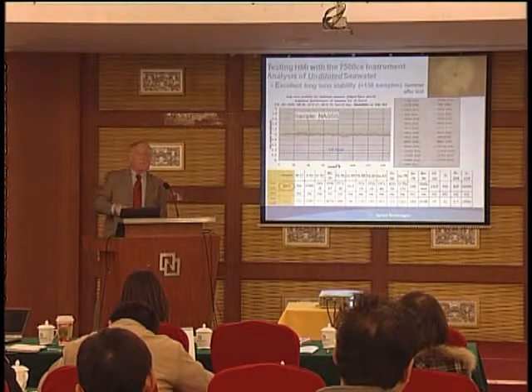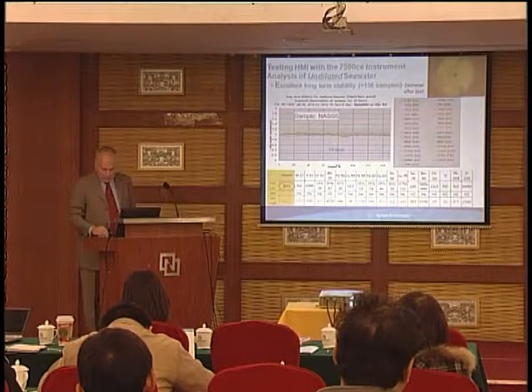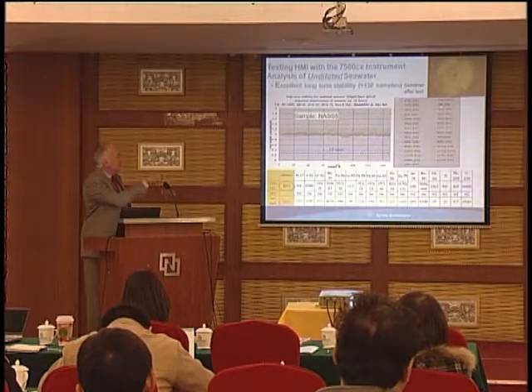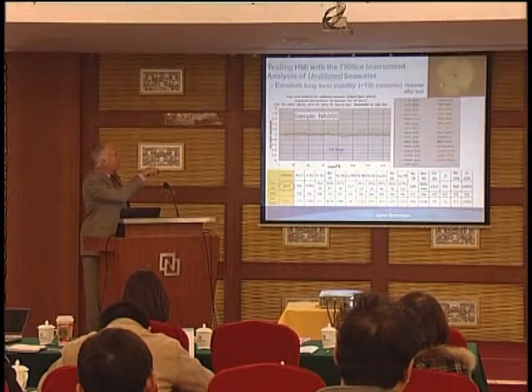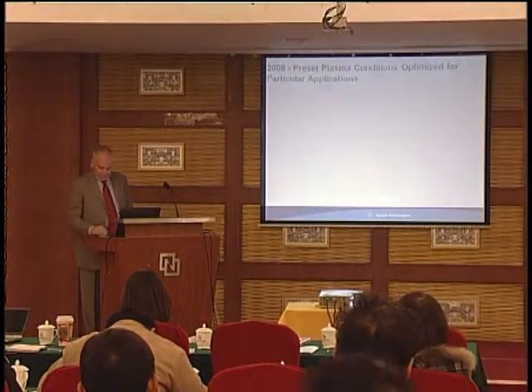So we still have the sensitivity for trace analysis in a very high matrix sample, and that had never been done before with ICP-MS. You can see this is kind of a picture of the skimmer cone after that analysis. There's some sodium chloride built up here, but the opening is still open.